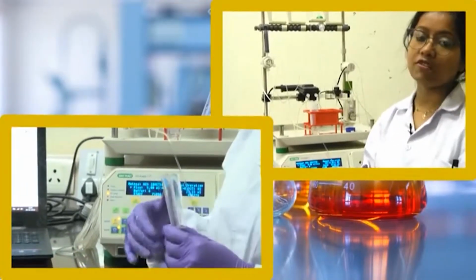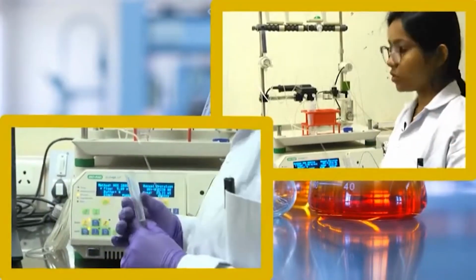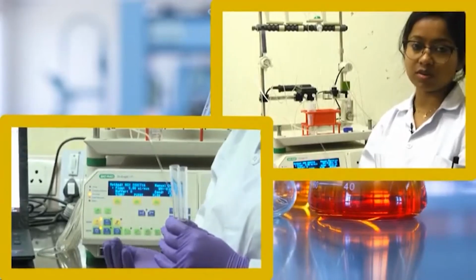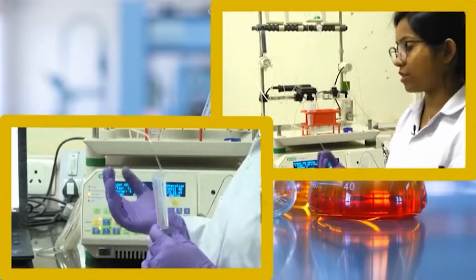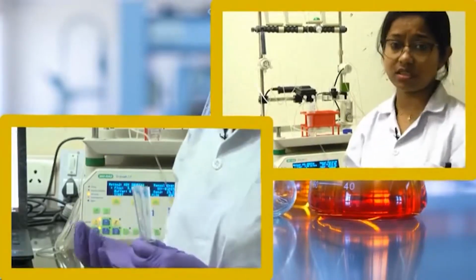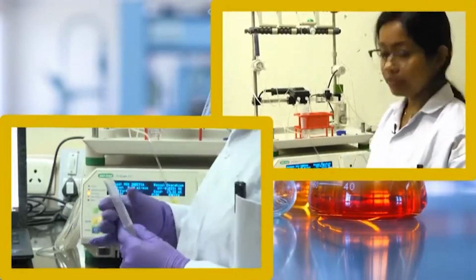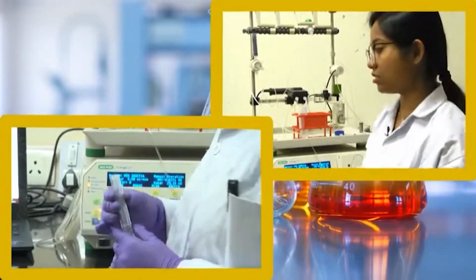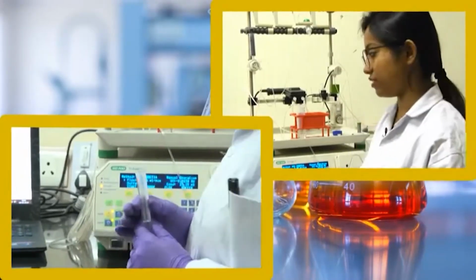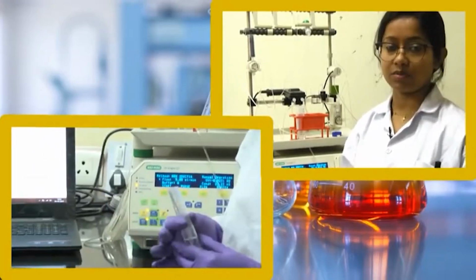So then again you have to go for another round of purification procedure. Suppose if there is too much variation in the molecular weight, you can go for size exclusion chromatography, or suppose you have a particular affinity tag or ion exchange, you have to go for that to get a pure protein. Mostly in the case of Ni-NTA column purification or IMAC purification, it is quite pure and you do not need to go for any other purification protocol.